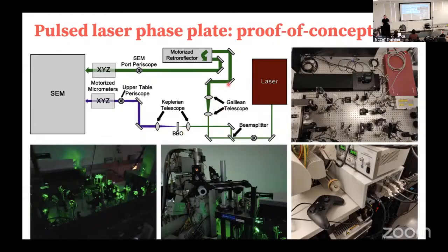One stays as green, so that green continues around to the bottom of the microscope where you're going to try to deflect the electron beam. The other half you send through a crystal and you frequency double it, so you change it from 512 to 256, so you end up with UV, ultraviolet light, and that ultraviolet light goes to the FEG, because we find that we get more electrons if there's a certain work function for the FEG, and then above that, the energy that you put in, you'll get electrons coming off. So we send the UV to the tip, and so this is what it looks like.